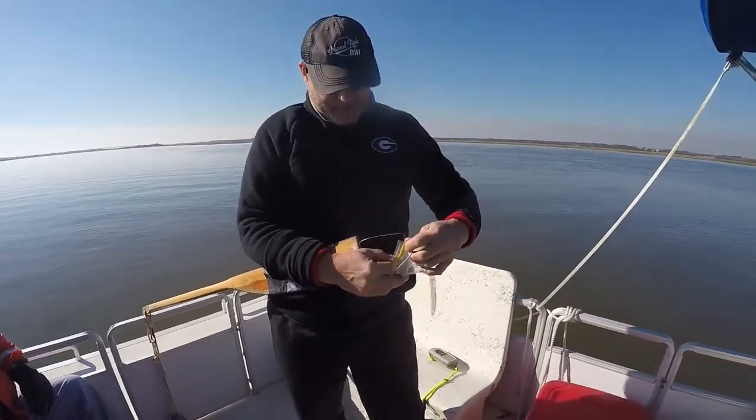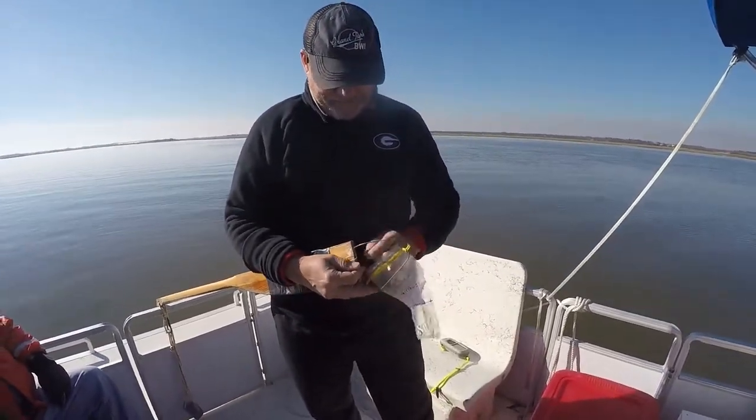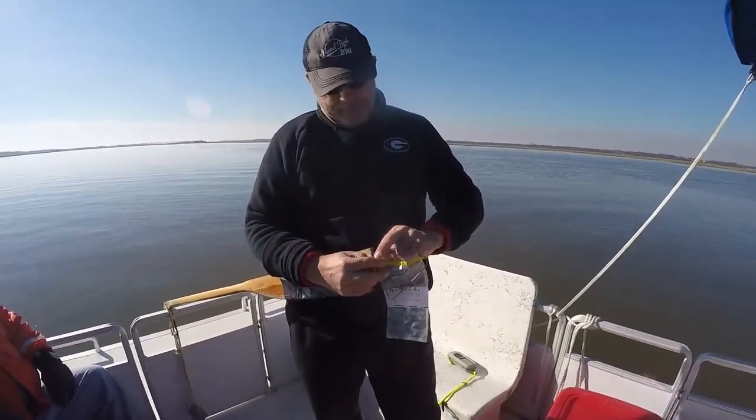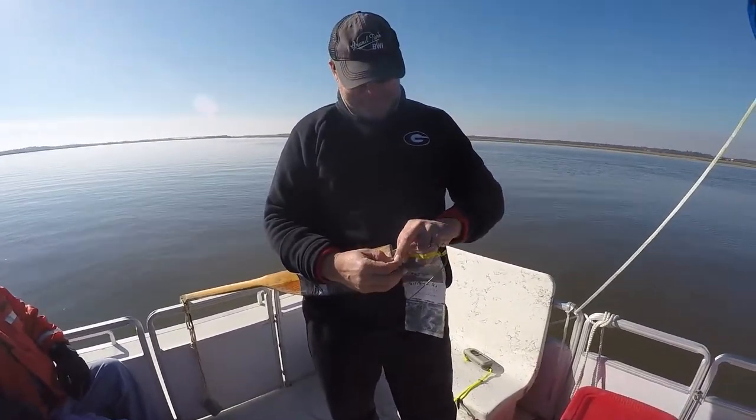We attach it, going around twice. Twice — not once, but twice. Not three times. You don't have enough; you run out of wire.